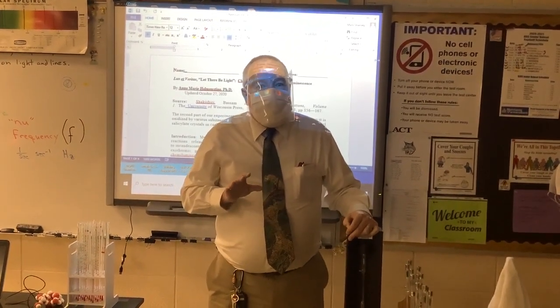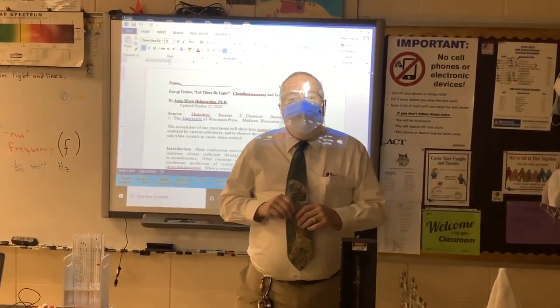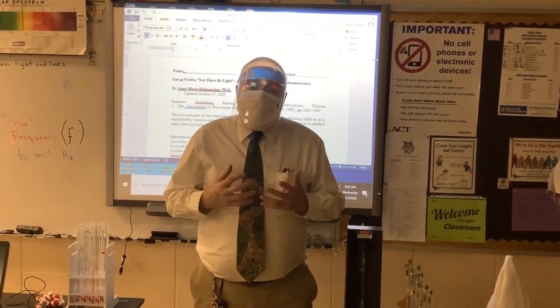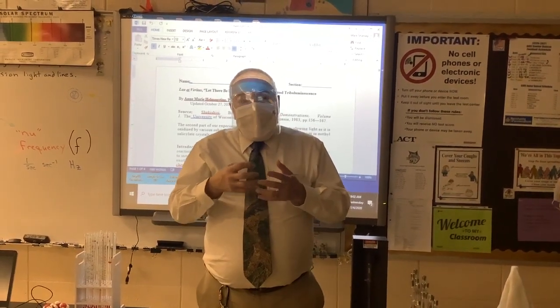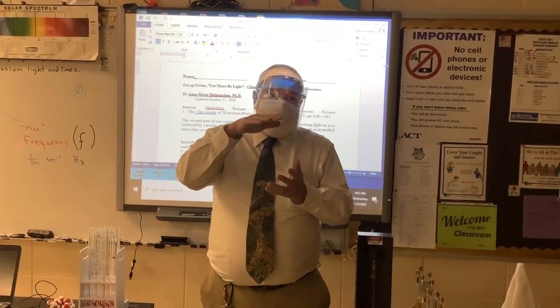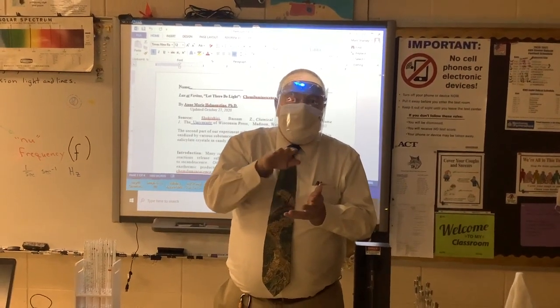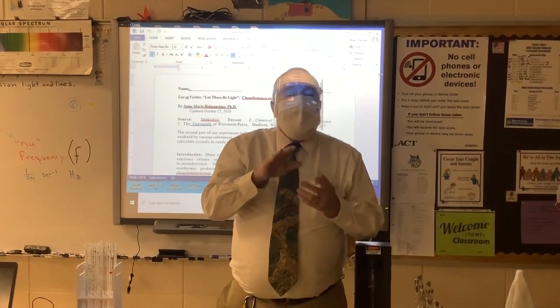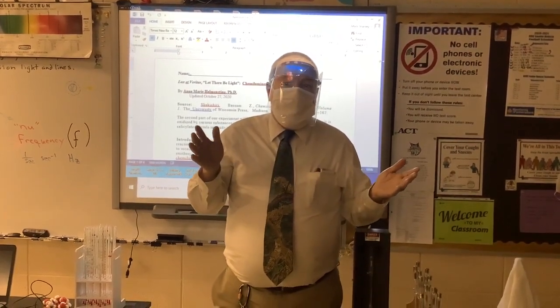and get them to produce light. One way is to use a chemical reaction to release energy that is subsequently absorbed by electrons in a molecule that excites them and allows them to move up and then decay or return to ground state with the emission of light of a specific wavelength. Now that happens in biological organisms as well.